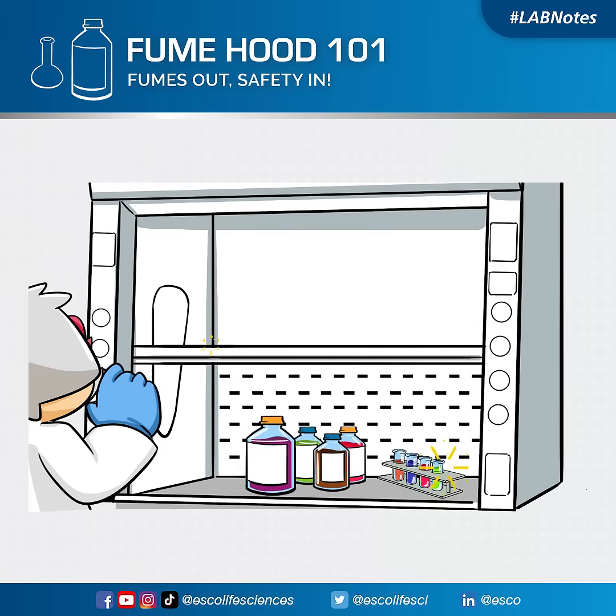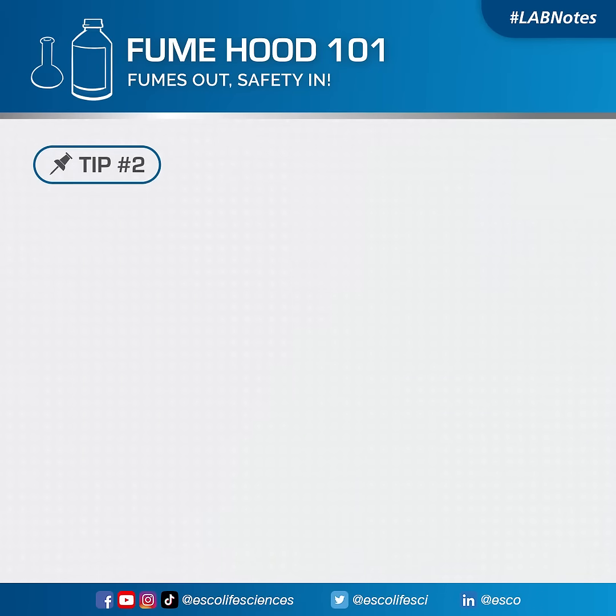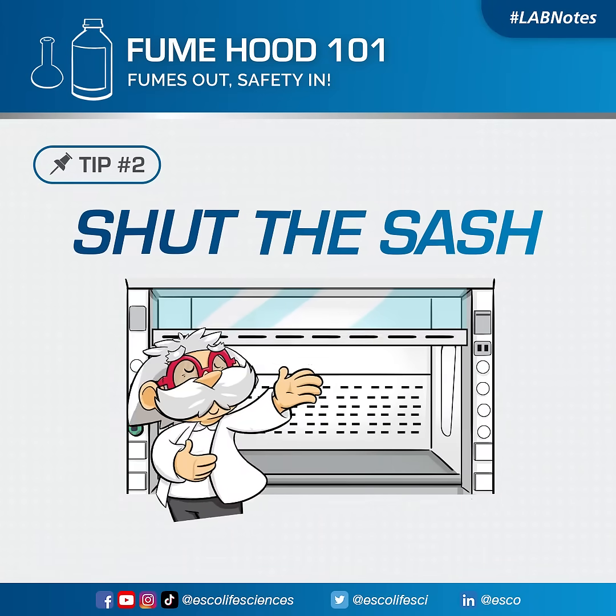Fumehood 101: fumes out, safety in. Tip number two: shut the sash.